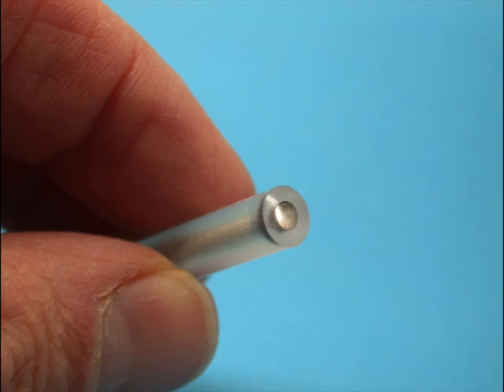This is another type of carbon electrode that's known as glassy carbon. It has an extended conjugated pi network similar to graphite, but its structure is more like ribbons of condensed rings rather than extended sheets as you have in graphite. This material is nonporous and provides a more reproducible surface.